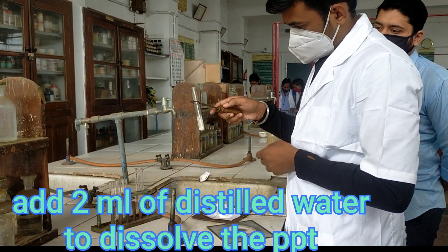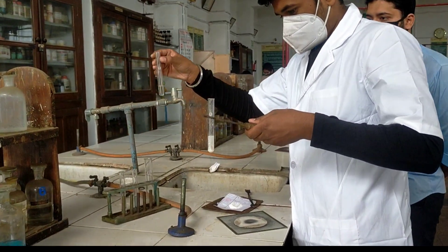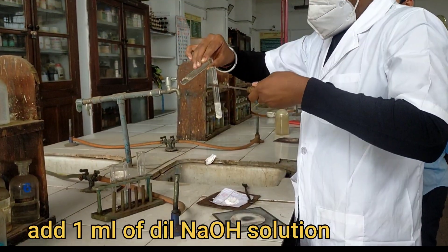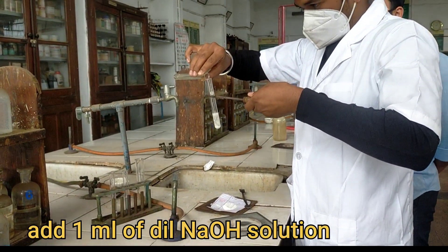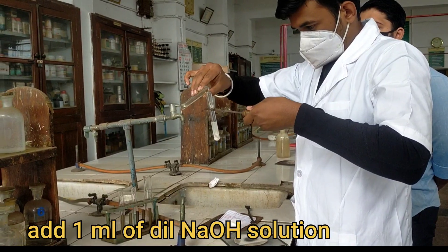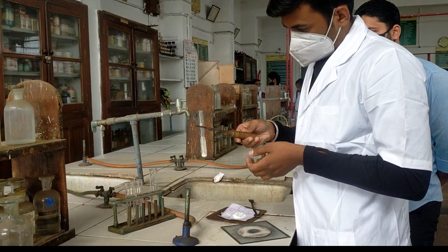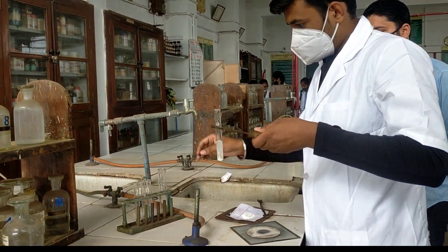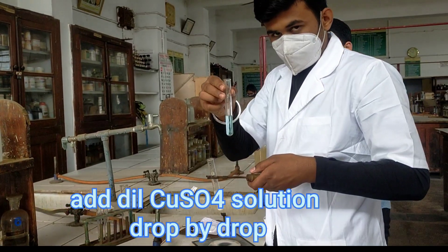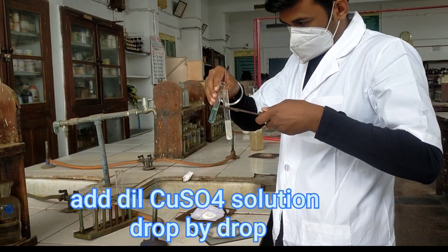Now add 1 ml of dilute sodium hydroxide in it. Then our next step is to add dilute copper sulphate solution — add it in a dropwise manner, slowly.